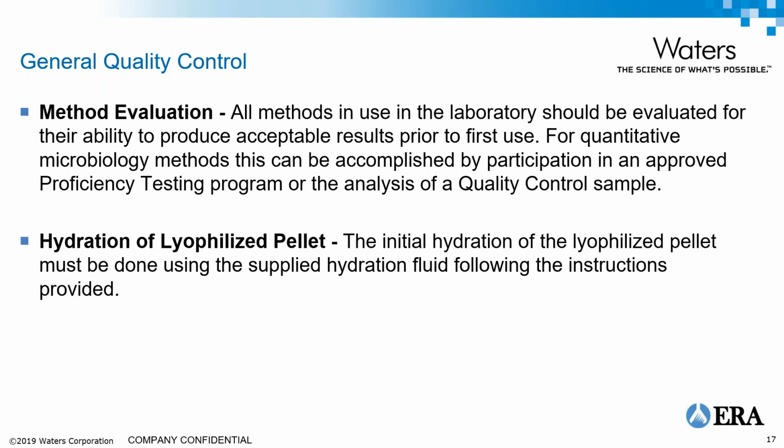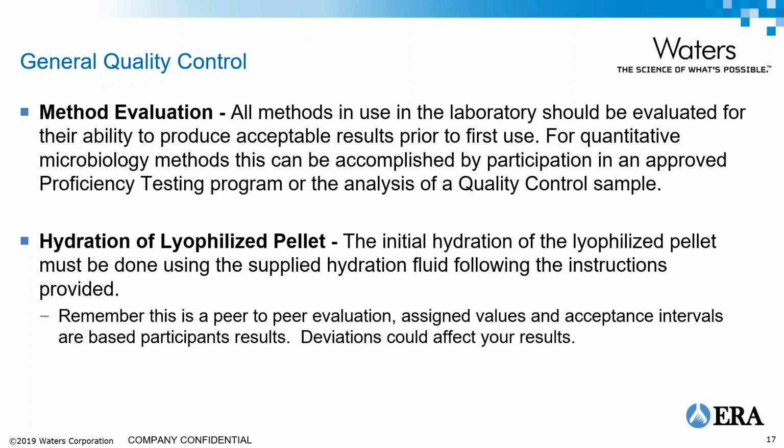Hydration of the lyophilized pellet. The hydration of the lyophilized pellet really needs to be done with the buffer solution or the hydration fluid that's provided and by the instructions that we provide. I want to point out that this is a peer-to-peer evaluation. You're being evaluated against everyone else running this sample. You need to make sure that the way you rehydrate it is consistent with everyone that's participating in the study. So if you deviate from that, since that assigned value and acceptance interval are going to be based on all of the participants' data, you want to avoid going off script, so to speak.